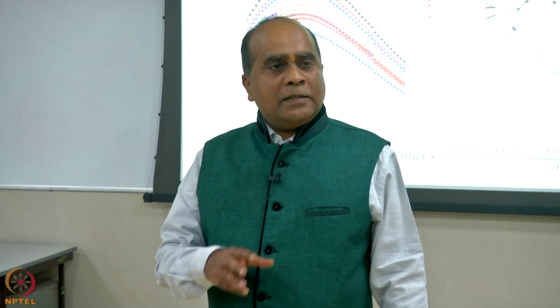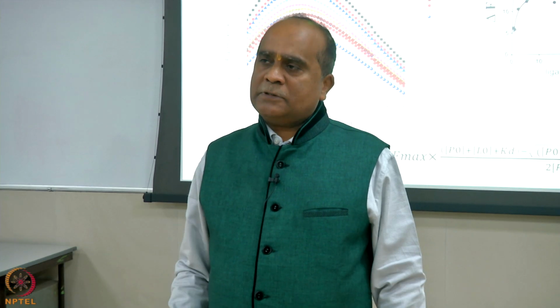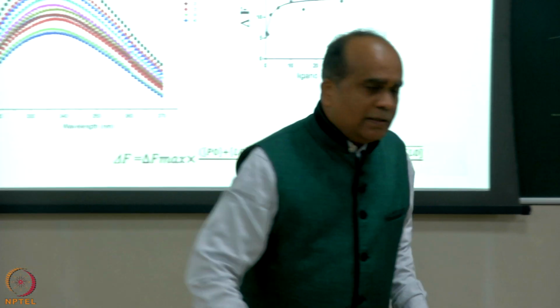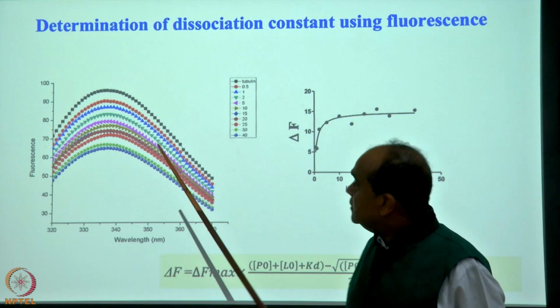Not only a quicker way, it is a quantitative way to find out whether it is a binder or not. Tubulin is a monomeric protein, it polymerizes, you have to give something, it is an active process of polymerization, requires energy. So, we are using monomeric tubulin, and for monomeric tubulin, this is my spectrum, right. This is my spectrum.